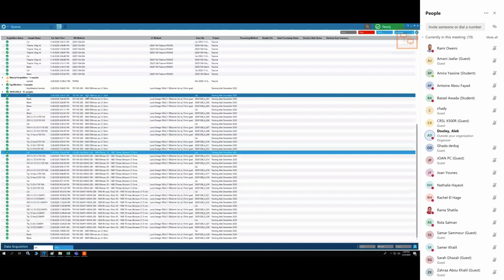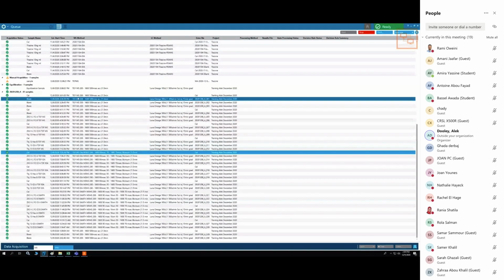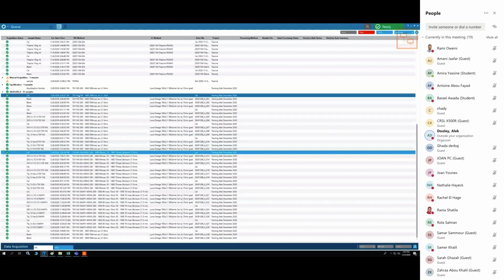So I think definitely we should have done the quick check yesterday. If we had done that, then our beginning numbers would have been a little bit better. So that's something to keep in mind. The next time we run a batch, I'll definitely show you how to do the quick check. Then you can do that based on your judgment of how long it's been since the system has been used.